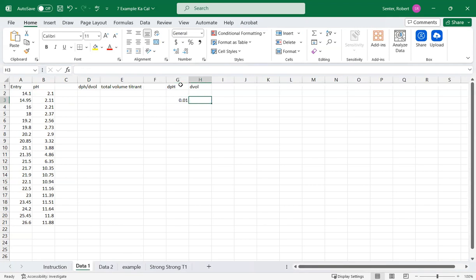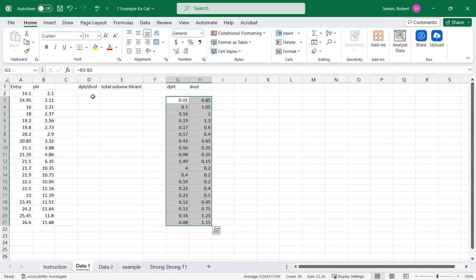And so here I can copy and paste this over here, and then just click in there. We'll see how it shifted everything to the right. So I can drag it over and make it to the left and get these numbers. And now that you have these, you can fill these down. If you have a ton of data points, you can use some shortcut, or we can fill down like that using Control D on PC or Command D on Mac.